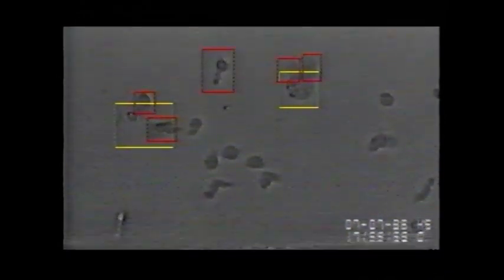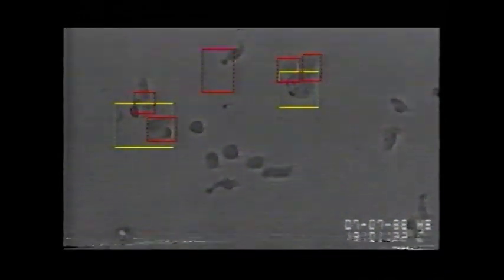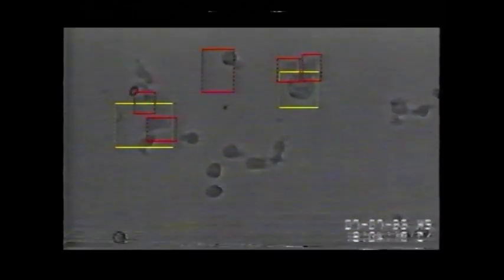Further on, the CTLs will appear in red boxes, and as you can see in this picture, the cytotoxic T lymphocytes have been able to recognize specifically a tumor of the mouse DBA2. This tumor is a mastocytoma P815, and this is why we called this clone of CTL T lymphocytes P815.